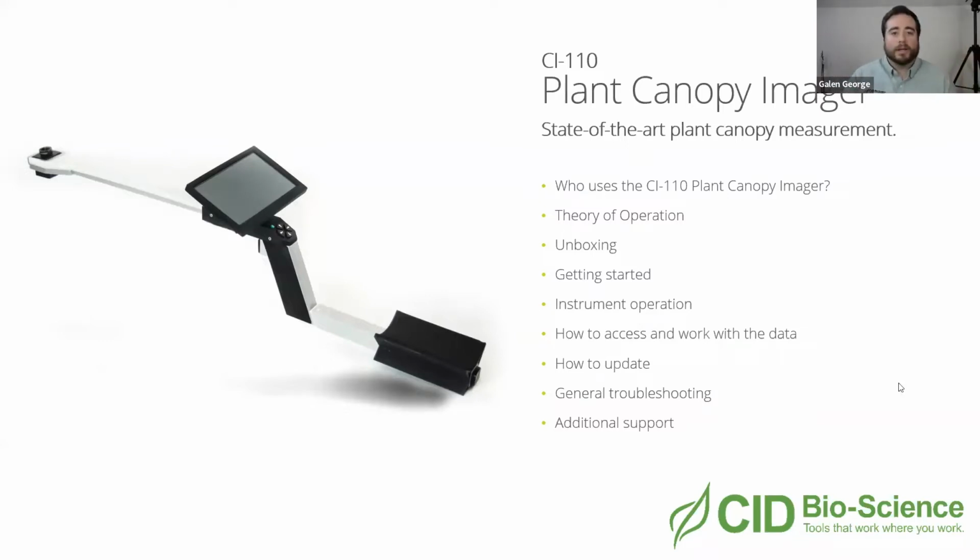So what I'm going to do now is actually transition over to our unboxing, and I will stop sharing my screen and change over my cameras so that we can actually get into seeing what all comes in a package when you get a CI 110 instrument.